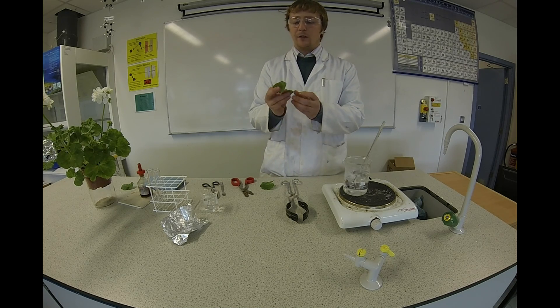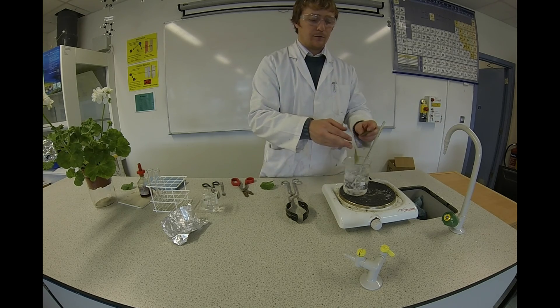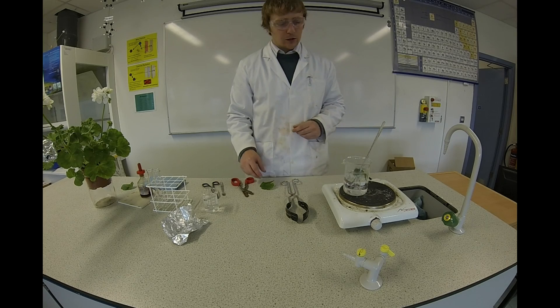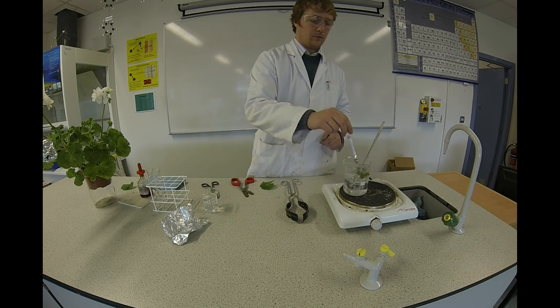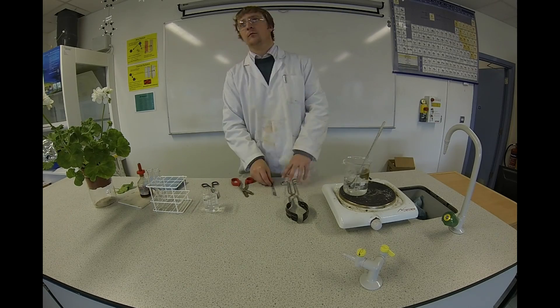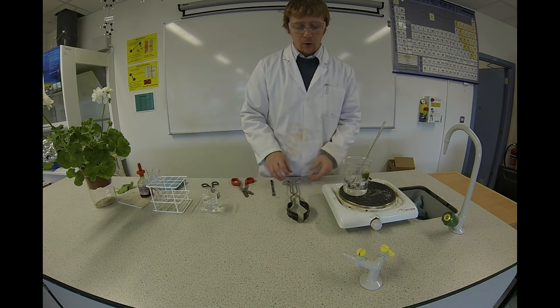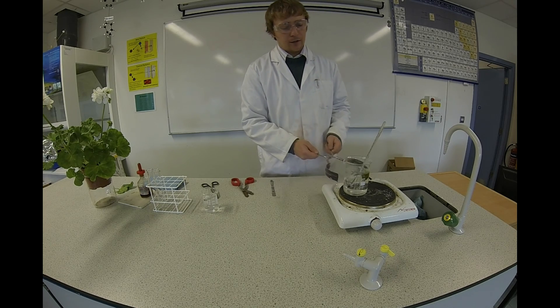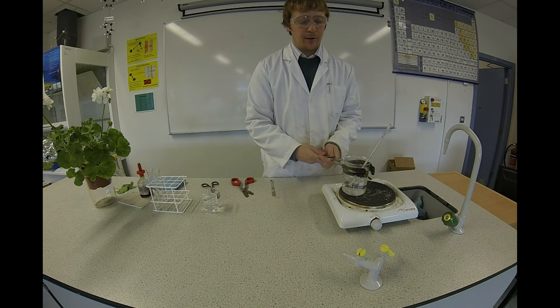The first step is to boil both of these in boiling water for about two minutes. What this does is it kills the leaves. The leaves are now well and truly dead, so I'm going to take them off the heat. We don't need the boiling water anymore.